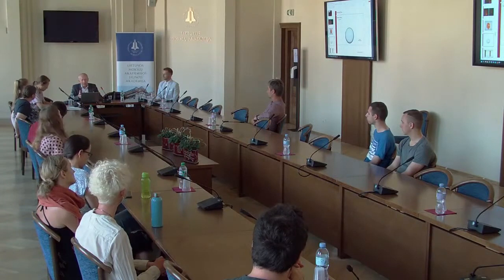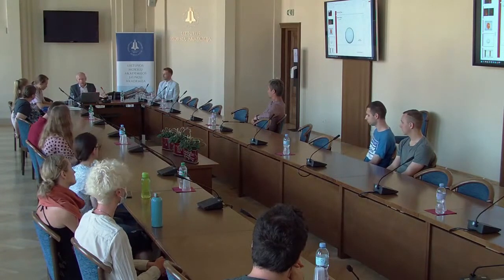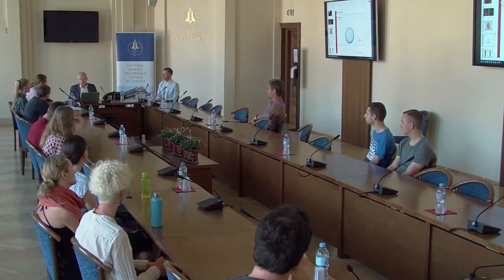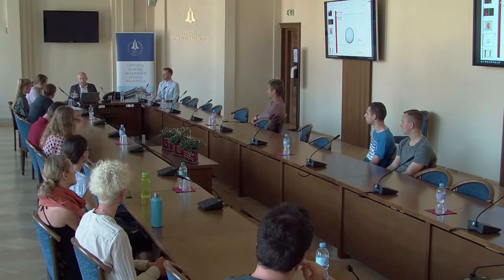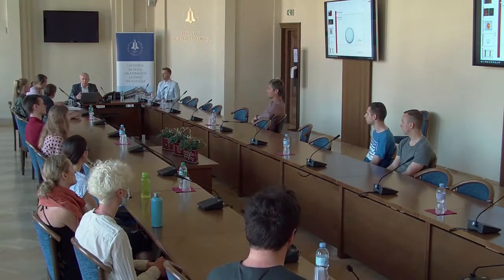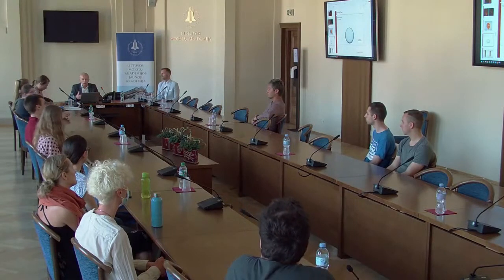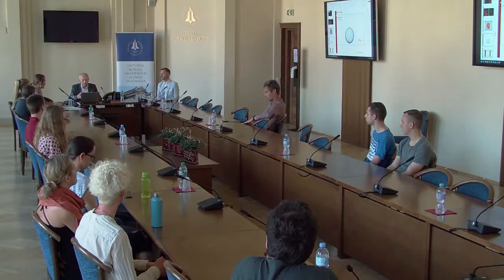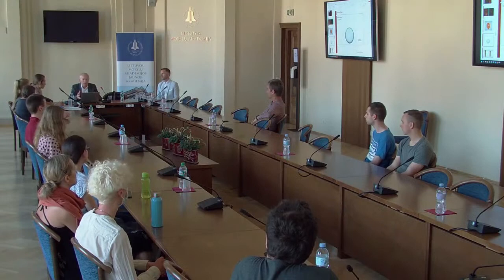Tas greitas matavimas priklauso nuo to, koks tavo stiprus šaltinis, kiek fotonų tu gali duoti, kad gautum gerą signalą. Tam reikia labai galingo šaltinio, ko gero. Mes nematuojam pavyzdžių, kurie keičiasi laike. Dažniausiai pakeiti, atneši, matuoji, tada vėl pakeiti, vėl atneši, matuoji. Arba tu vietoj gali keisti, bet kai kažką pakeitė, jis turi jau būti stabilus matavimo metu. Kadangi matavimas užtrunka, sakykime, 4 valandas.